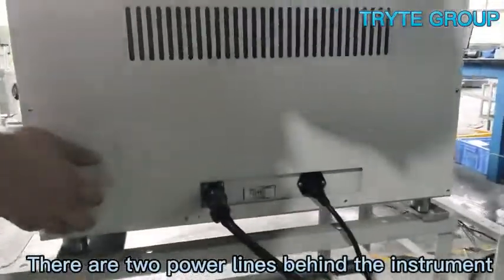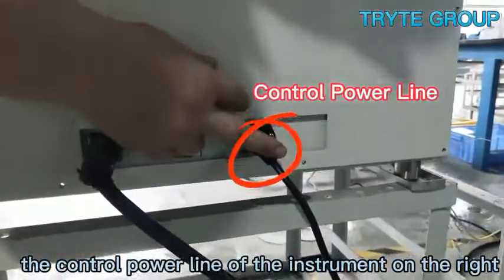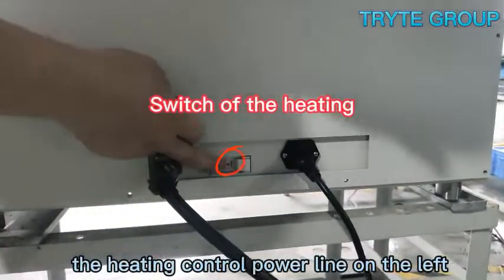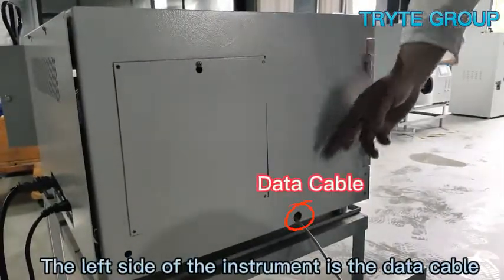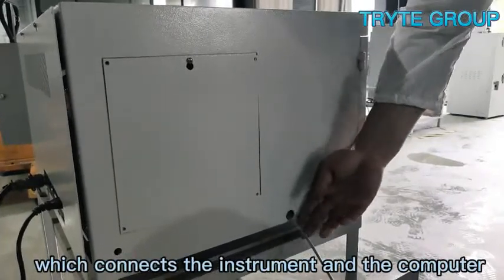There are two power lines behind the instrument: the control power line of the instrument on the right, the heating control power line on the left, and the button in the middle is the switch of the heating control power line. On the left side of the instrument is the data cable, which connects the instrument and the computer.